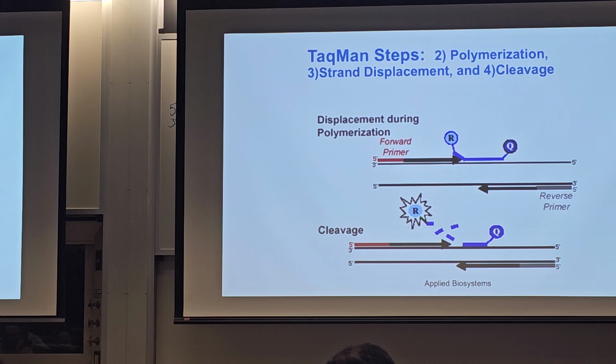But how do we know that it's a complete amplicon? How do we know that we go all the way through to the end? The PCR that we're doing here, we always keep the primers pretty close together. Very common would be somewhere between 100 and 150 base pairs. So these are really close. So that enhances the probability that our molecules are all going to the end. This 5' to 3' exo activity is really efficient.